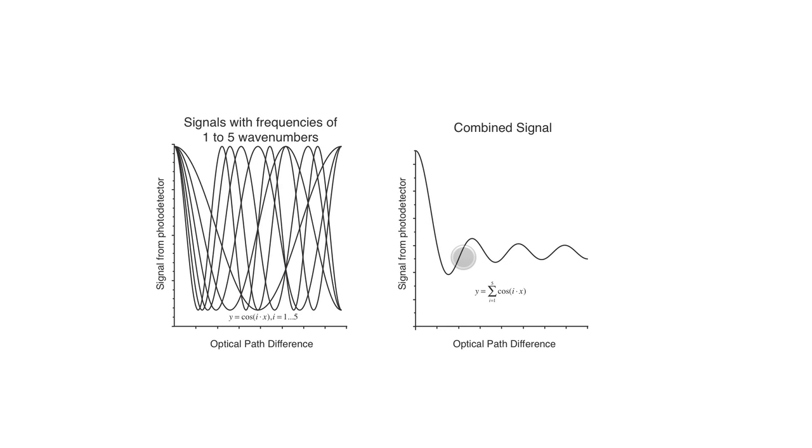And if you're looking at IR, which of course would have an infinite number of frequencies between every single one of these frequencies, it settles down pretty quick and stays pretty quiet in the wing. So you need an instrument with low noise to measure. This is the important signal out here.